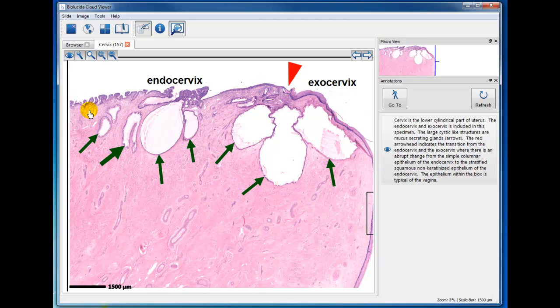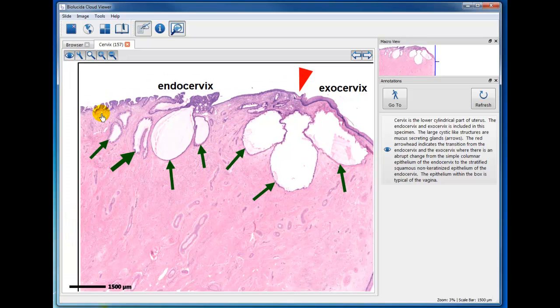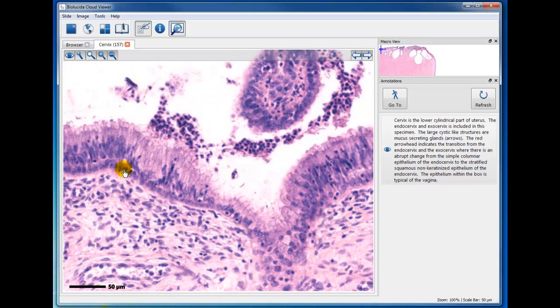change from the simple columnar ciliated epithelium of the uterus, which you will find here and all the way up about right into this area. And these are the cervical glands that secrete mucus, and they lubricate the vagina, as well as glands in the labia majora and down at the entrance to the vagina from the outside, because the vagina itself has no glands at all.